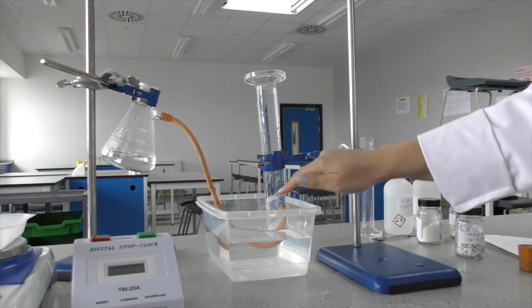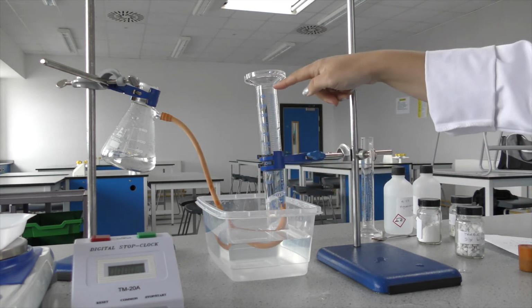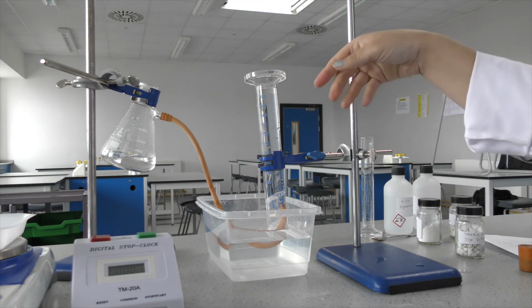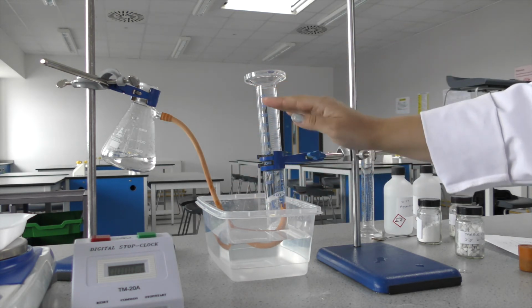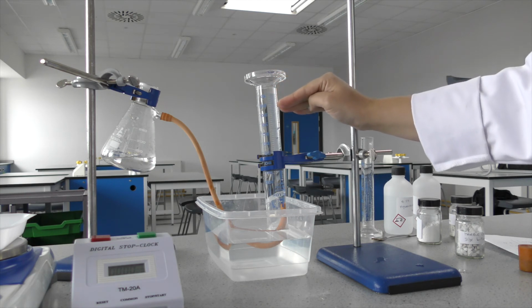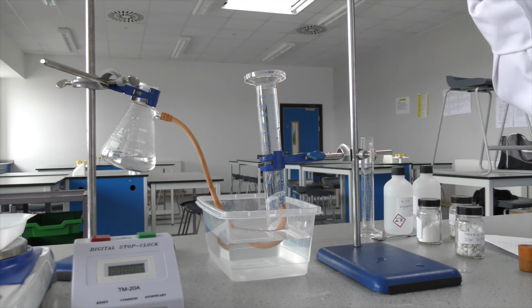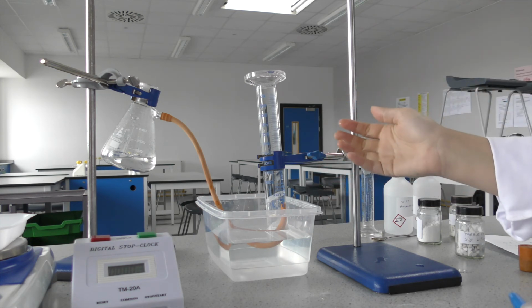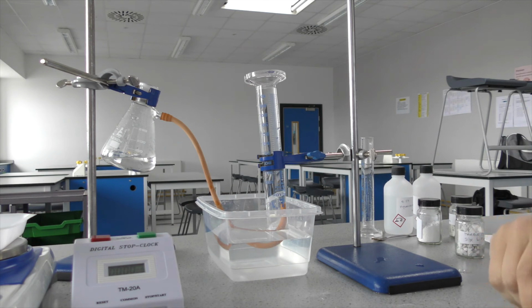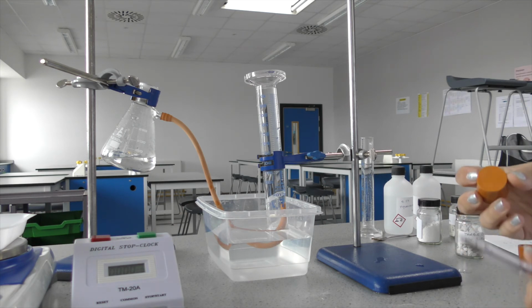See, I've set up the measuring cylinder. It was full of water and I've tipped it upside down and it's now held in place. There's tubing running up into the measuring cylinder, so as gas is released, the water will be displaced and we can measure the volume of gas released. This is quite a fiddly thing to do. It's much easier to do in pairs, so I would work with a partner as you do this.